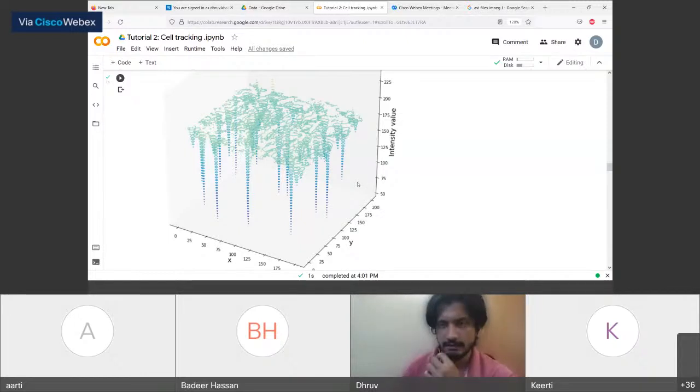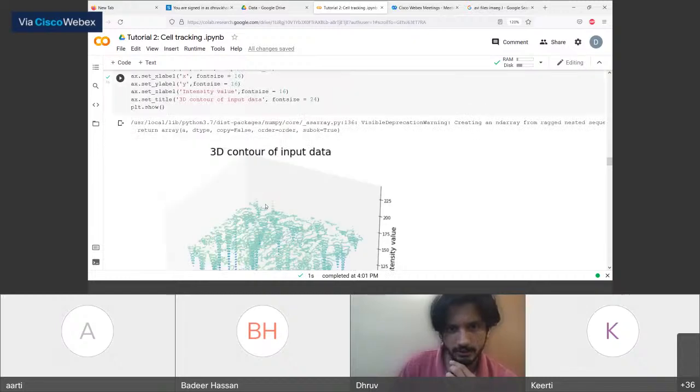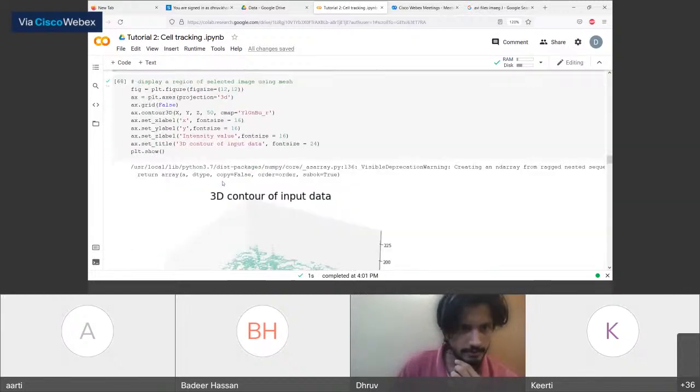Since I want the dark regions, I will remove everything from 100 or above, and I will get these dark spots. So that's how thresholding actually works. It works on the intensity gray values. But what we will do is something called image filtering, broadly known as blob detection, to detect these dark granules.